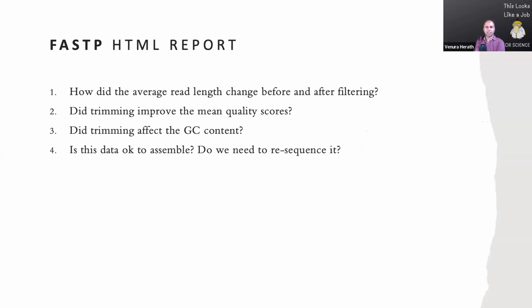The first question is, how did the average length change before and after filtering?